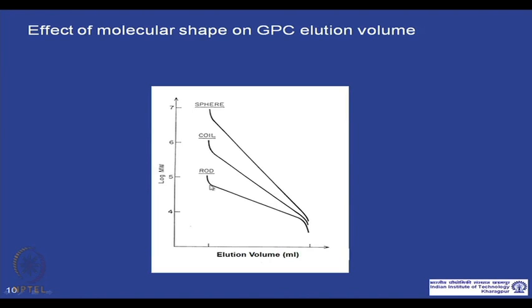So, obviously the elution volume will differ according to size. The molecular size changes, and the elution volume is related to molecular size, not molecular weight. Hence, the elution volume also changes.